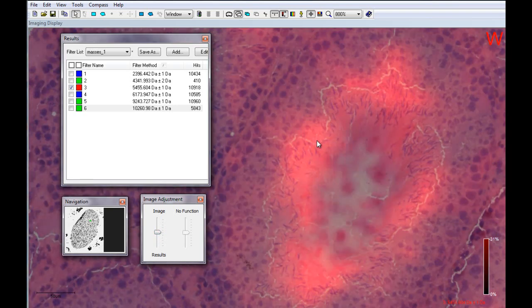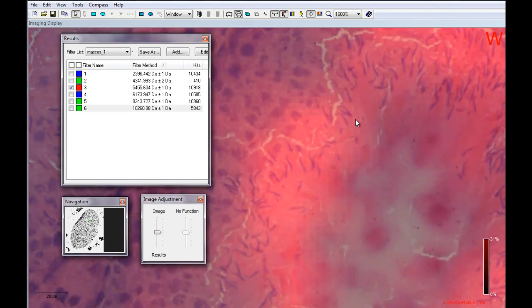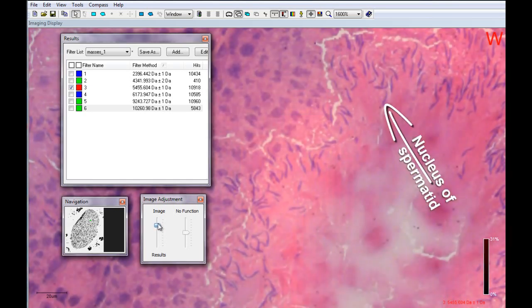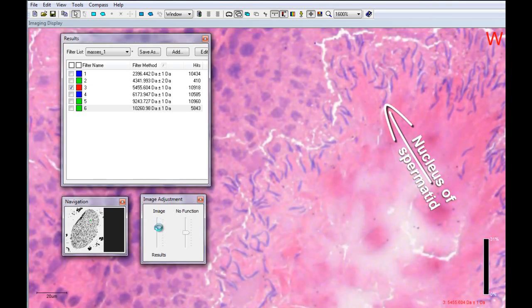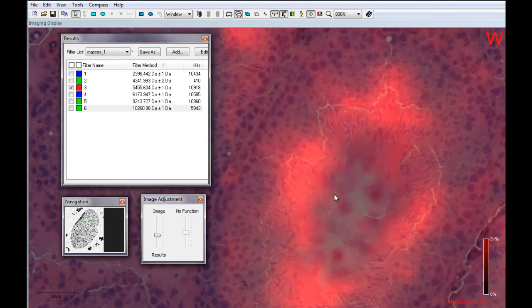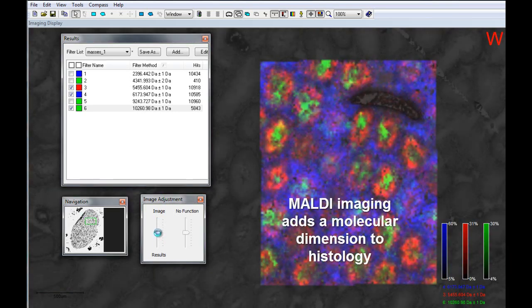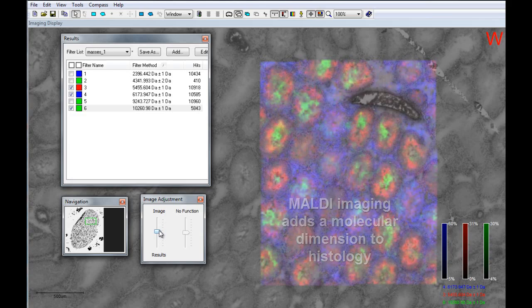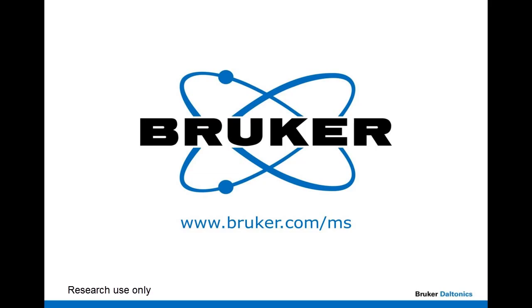The nuclei of the spermatids appear here as these blue comma-like structures indicated by the arrow. MALDI imaging adds a molecular dimension to histology. For additional information, please visit www.bruker.com.